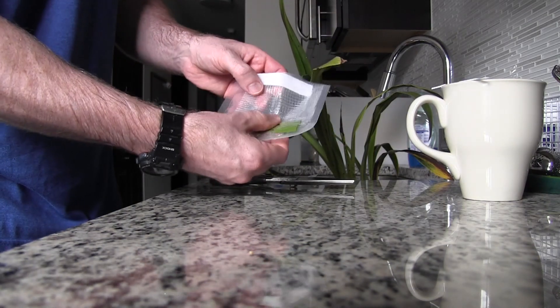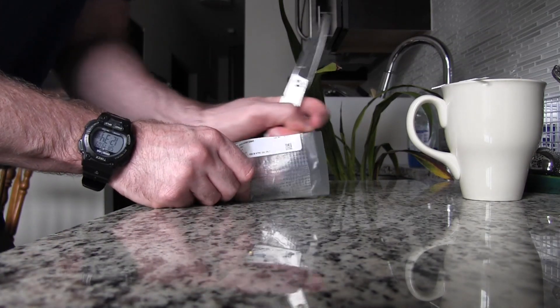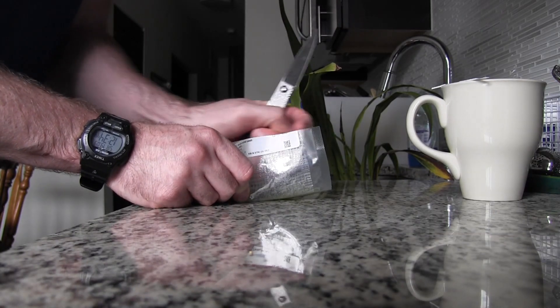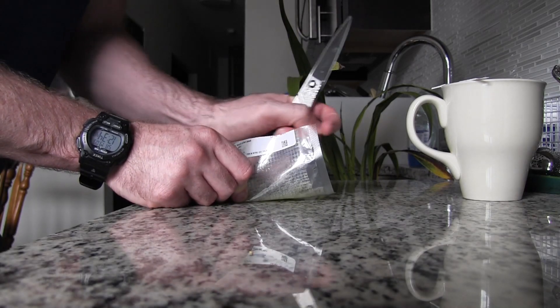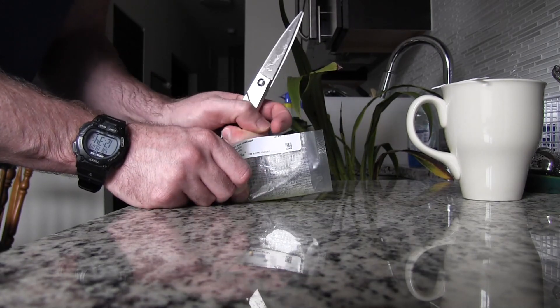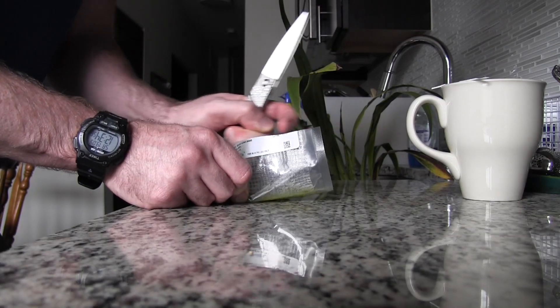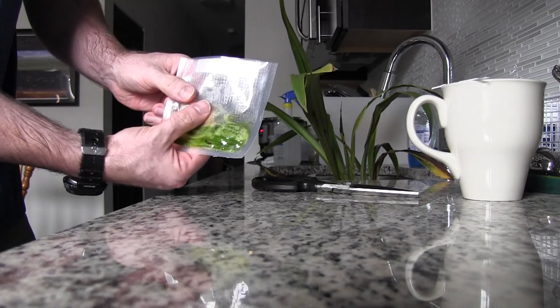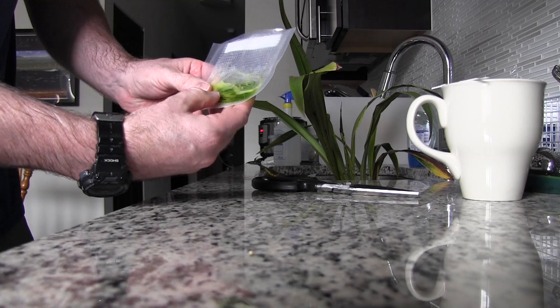Now it's all the way down there. I'm going to take just the edge of my scissors and grind it — I'm going to break those plant cells open and let all the juices come out until you start seeing green juice. I can see the green juice going, so we're good to do our test now.